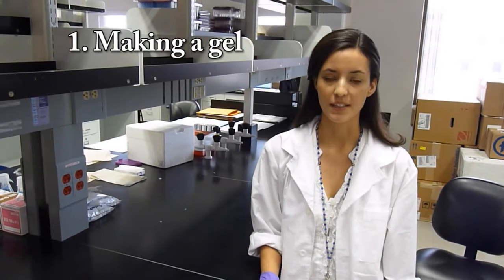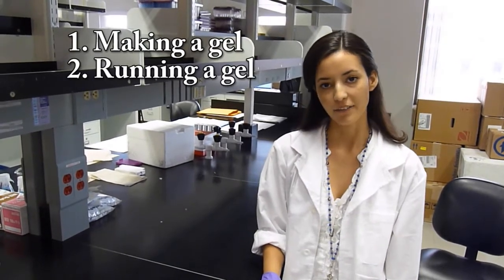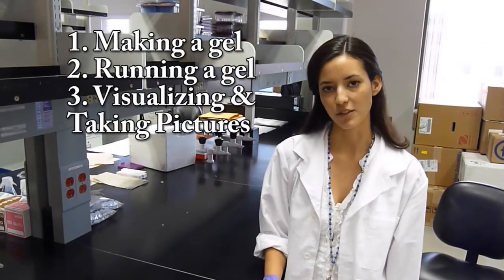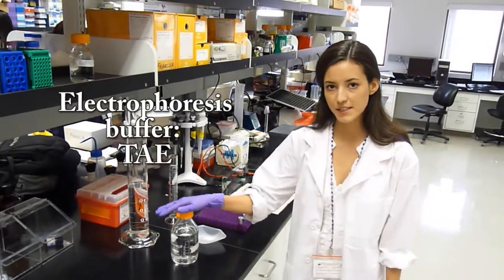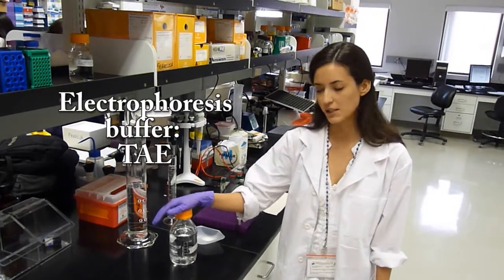This process is usually separated into three parts. The first is making the gel, the second is running the gel, and finally, visualizing and taking pictures of your gel. The materials you will need for this process are electrophoresis buffer. In this case, we're going to be using TAE.